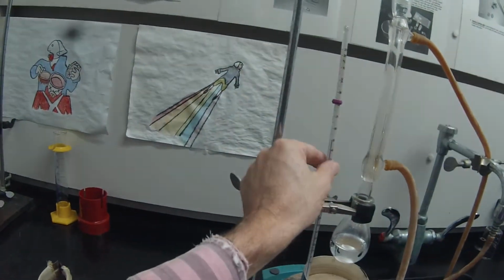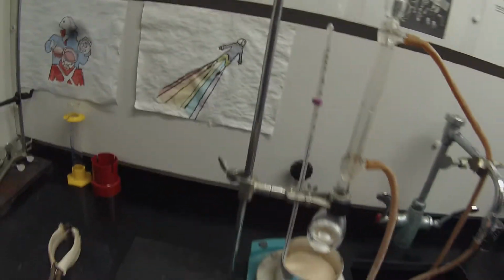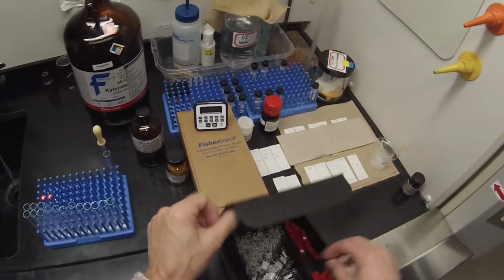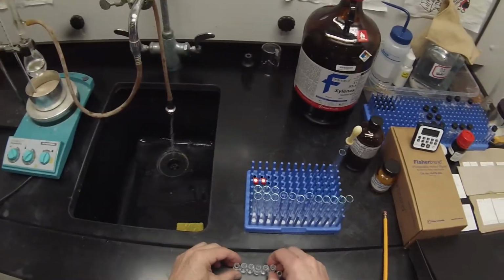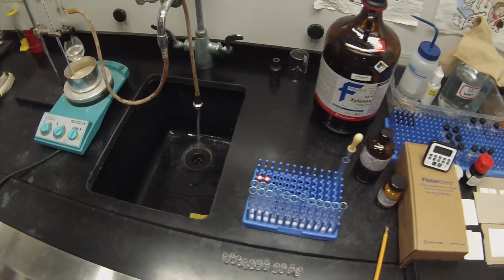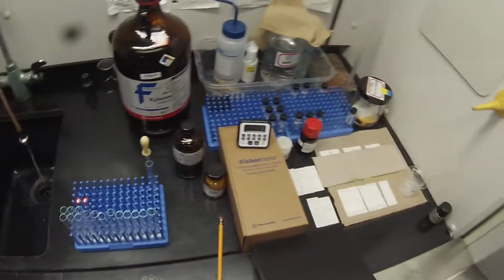So we're now at the 150 temperature that I want to be. And it looks like that's a setting of about 250 on the hot plate. Just going to leave that a little bit to see if that temperature stays constant or rises a little bit. And while we're doing that, we can prepare the rest of the GC mass spec vials that we're going to need for each one of these time points. So we're going to need 15 of these. I think that's 15.